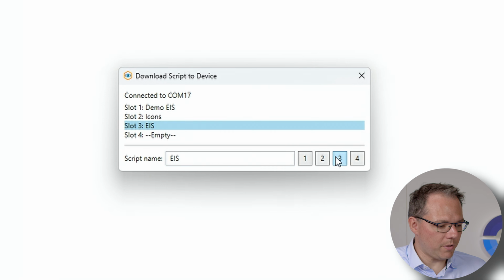I enter into the EmStat4T, then I press Load Script and I choose the EIS script. And it's performing an impedance spectroscopy. I could also do that, by the way, not being connected to PSTrace if I wanted to. I can repeat this measurement or I can just end now the script. That seemed very simple, but where's my data?